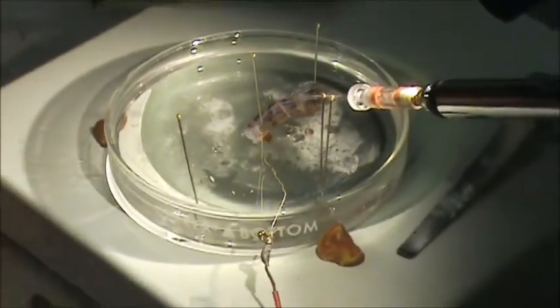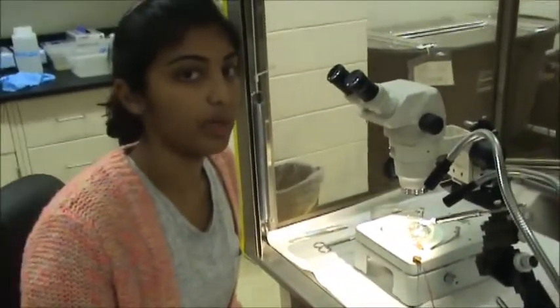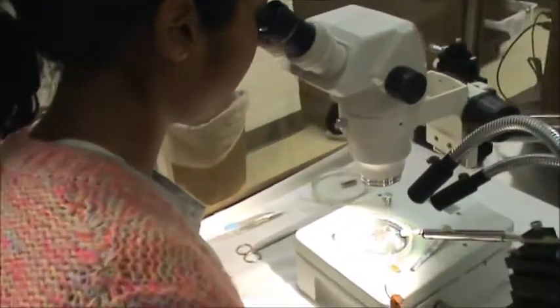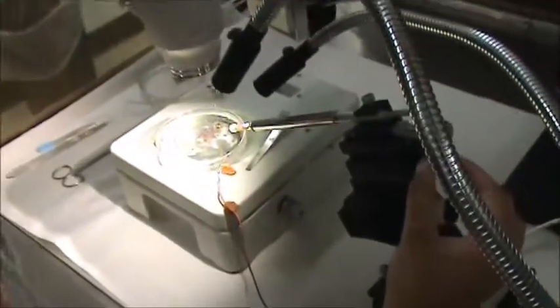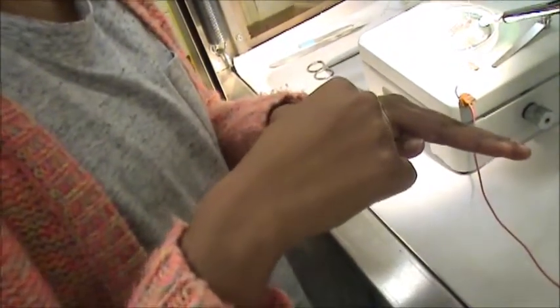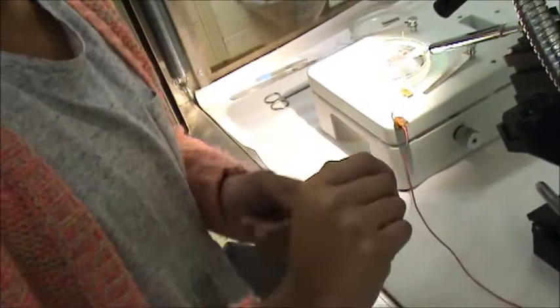So you can either start with the phasic muscles, which are the L1 and L2, or the tonic muscles, which is the SCL. So it's going to be kind of difficult to see the electrode, so you're definitely going to have to use this microscope. And you're going to want to push it into the muscle a little bit, and when it goes into the muscle, you're going to see it dimple just a little bit, and then if you pull out, you can see the muscle moving with the electrode a little bit as well. So that's how you know that you're inside of the muscle.